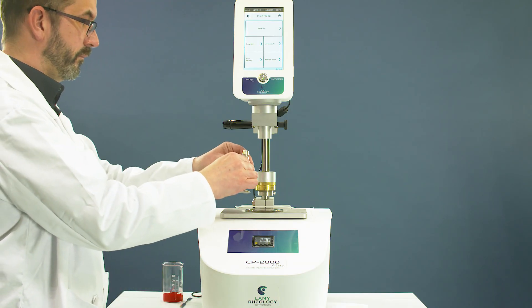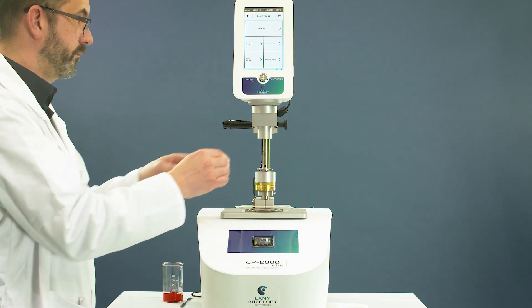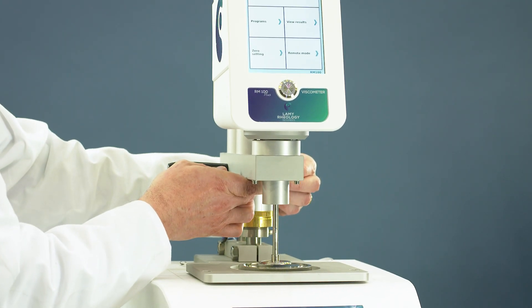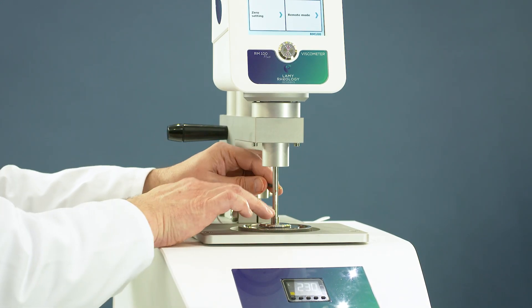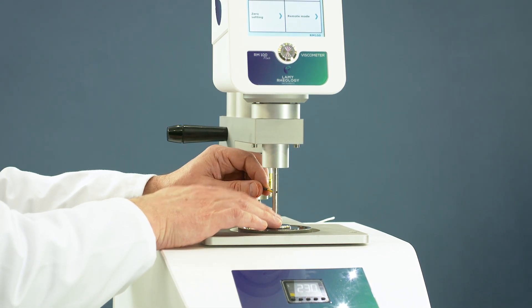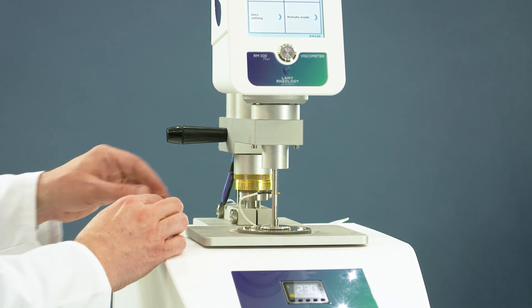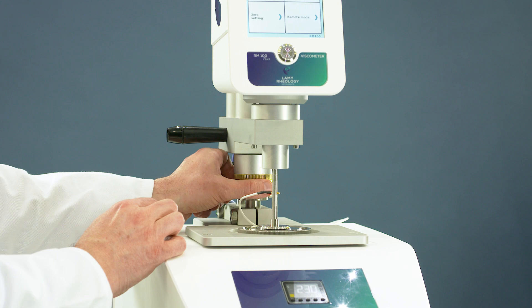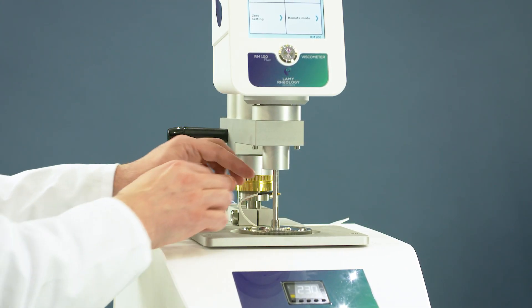Install the cone plate with the easy coupling AC265. Move down the measuring head, making sure that the cone plate doesn't touch the lower plate. Plug the white cable inside the spindle's shaft. Turn the brace ring clockwise until you hear the beeping sound — the measuring position is reached.